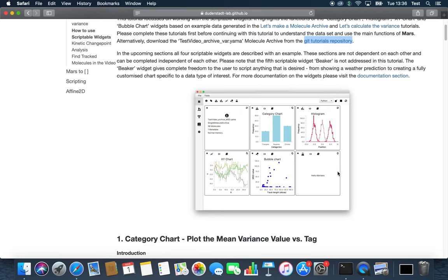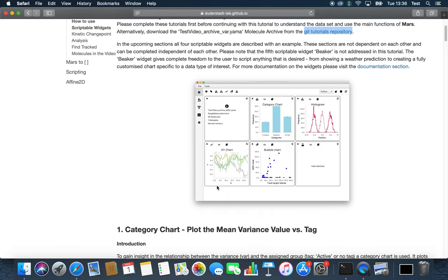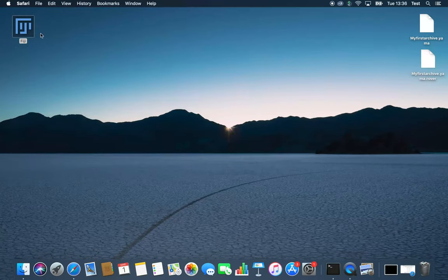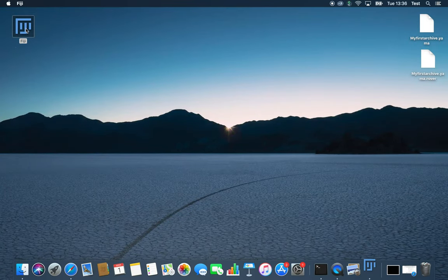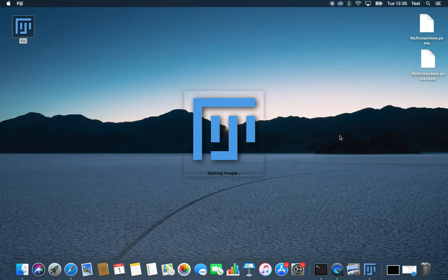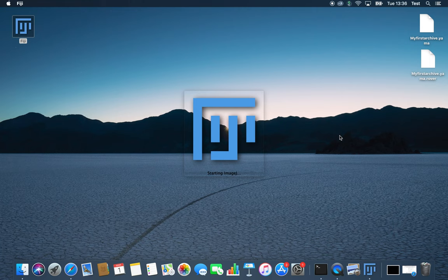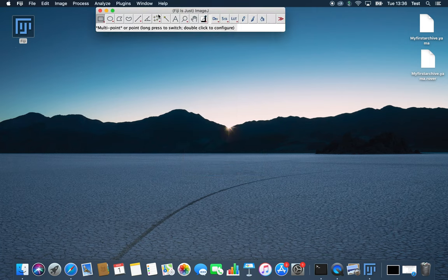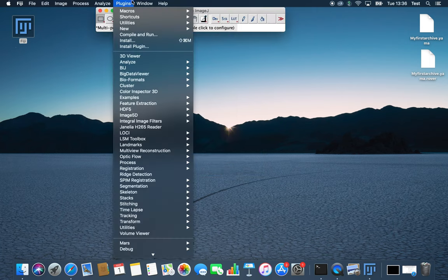The beaker widget will not be discussed in this tutorial. The beaker is a bit more complex and gives you the freedom to create your own type of plot. Also, if you want to do a more in-depth analysis, you can import data to Python. For that, please check out the tutorial about Python and molecule archives.